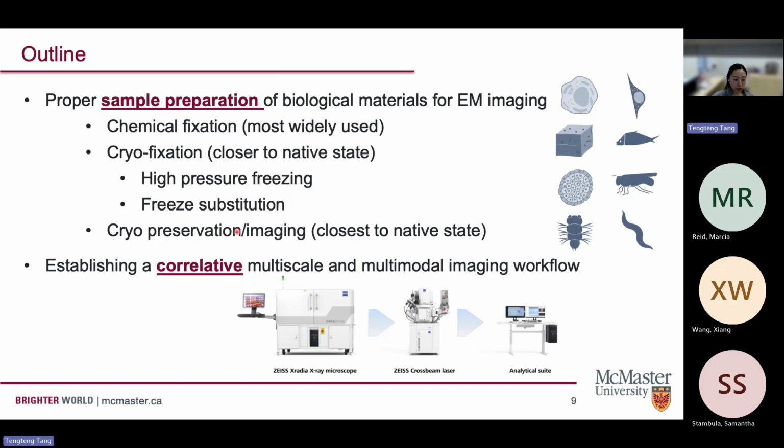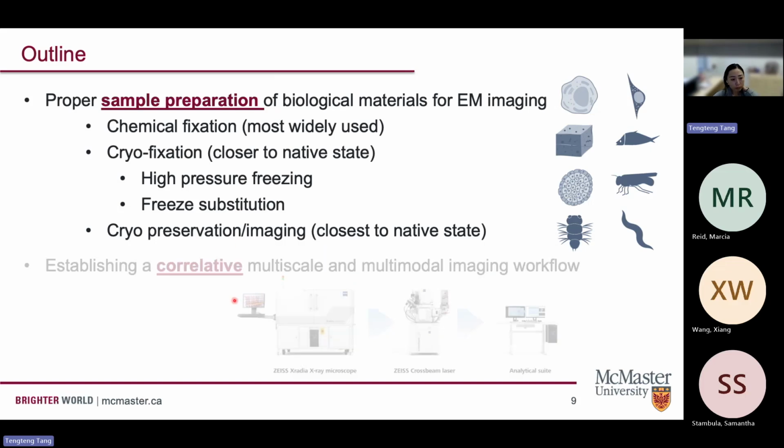perform such a task. And for the second part of my talk, I will talk about the recent work that we did at the CCEM, where after the sample preparation, we examine the human bone tissue across different length scales using a correlative approach.